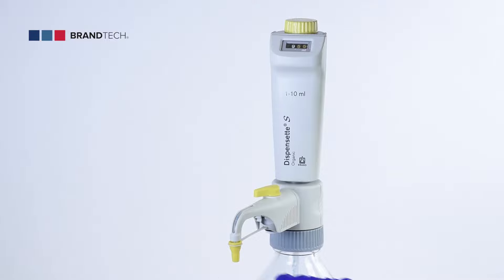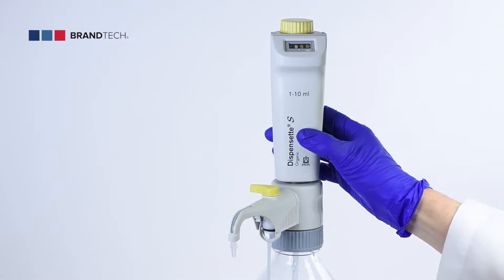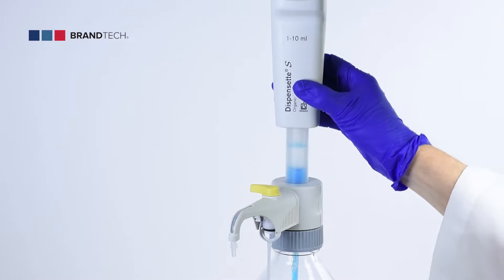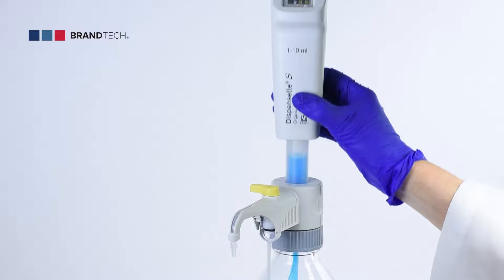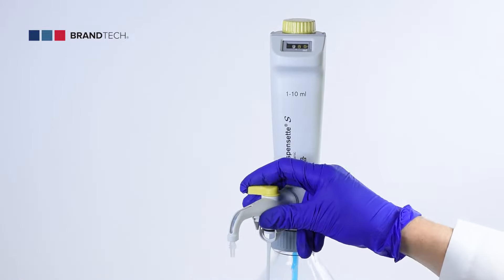To prime your Dispenset S, unscrew the screw cap of the dispensing tube and rotate the recirculation valve to the recirculate position. Gently pull up on the piston and push down to the lower stop. Repeat this process at least 5 times.